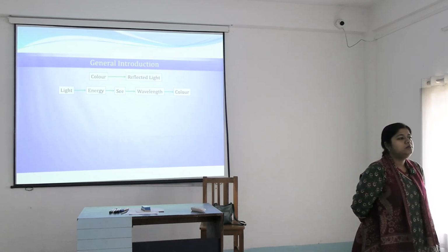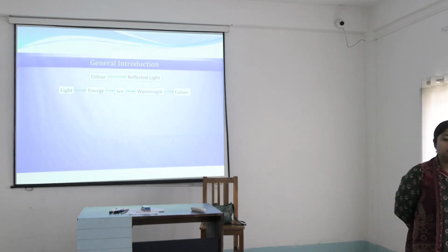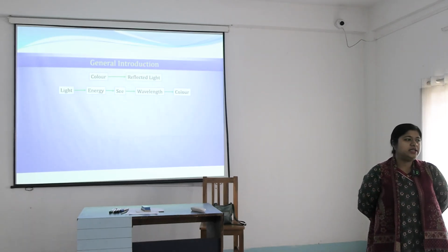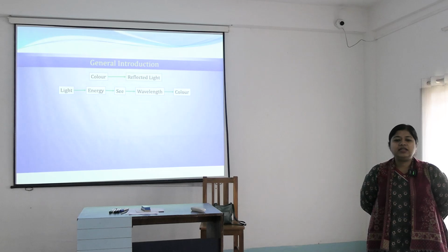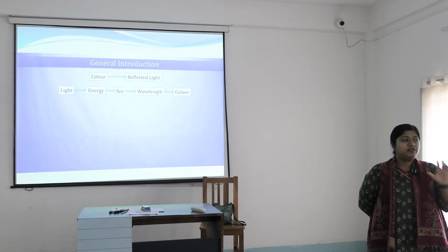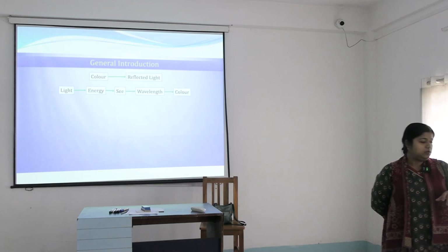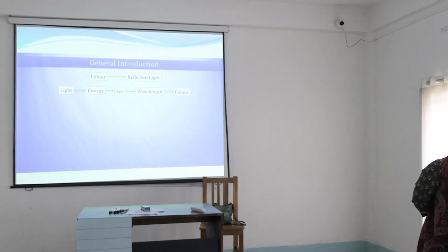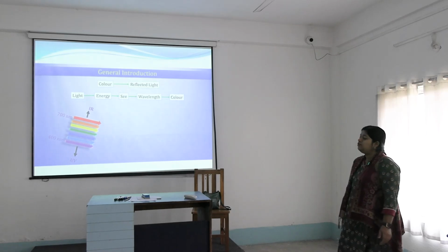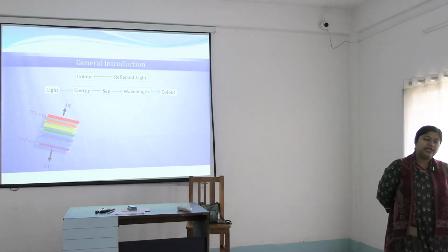So what is light? Light is a form of energy, and what is color? Color is the reflected light in the visible spectrum. So what is the visible spectrum of light? The wavelength range is 400 nanometer to 700 nanometer.